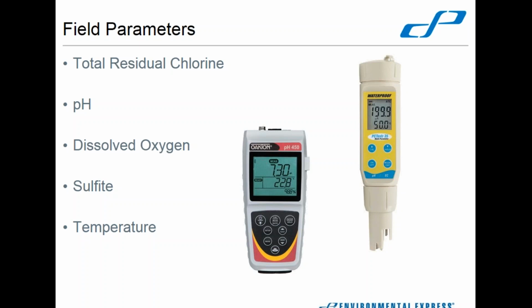Dissolved oxygen will change because you're cooling the sample. As water gets colder, it actually has a higher capacity to store dissolved gases. So it can absorb more gases from the atmosphere and have a different dissolved oxygen content from when you originally collected it. pH, also temperature dependent. And obviously you can't preserve it and still take a pH, because by preserving it, you change the pH. So leaving things unpreserved, the pH can go up and down depending on what else is happening in that sample.